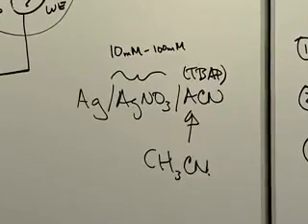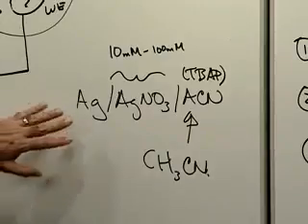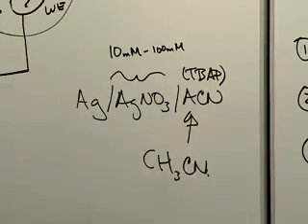Now, often that number is small, 10, 20 millivolts, and electrochemists aren't so concerned about that. And so you get away with it. But every once in a while, it can become a large number because you're using some very strange electrolytes, and you have an incompatibility, a big junction potential between what you have in your cell and what you have in your reference compartment. In that case, one would tend to go to a pseudo-reference.